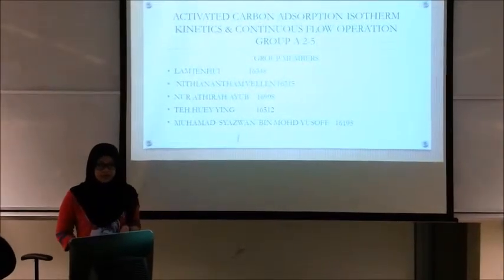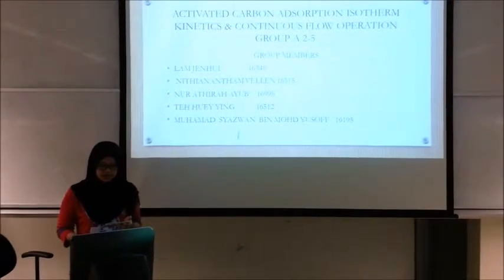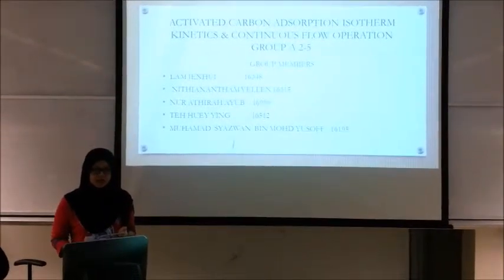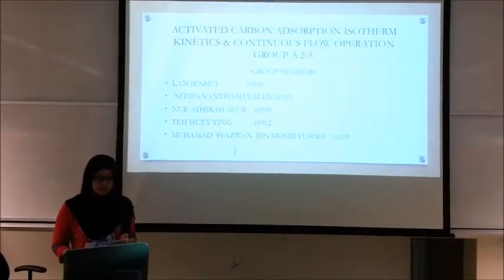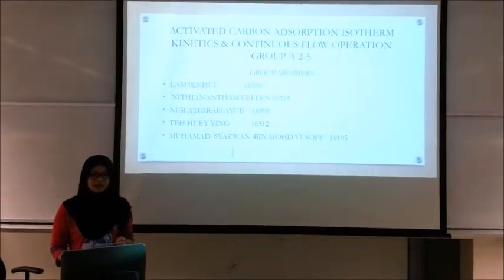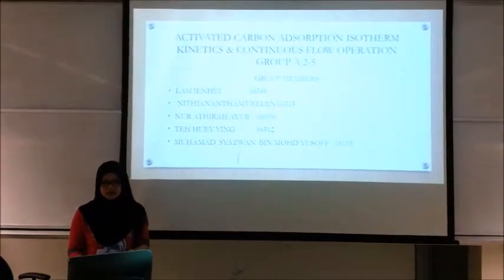At the end of the experiment, we came to the conclusion where our objective is achieved. Activated carbon and methylene blue solution achieved an equilibrium in 10 beakers, in which the concentration decreases appropriately at 27 degrees Celsius. Due to its high degree of microporosity, only 1 gram of activated carbon has a surface area in excess of 500 meters square, as detected by the gas adsorption.